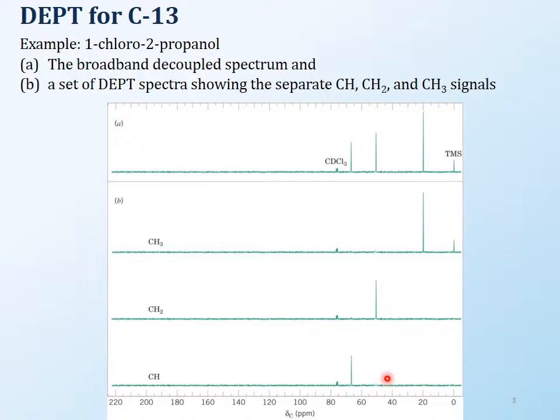That is really the neat thing about carbon 13. If you have a large molecule with 20 carbons and you're seeing 20 peaks there, then you really have no idea what's going on because there's no coupling and you can't tell which carbon is what. But if you do the DEPT on it, all those 20 carbons will be completely separated out into the primary, secondary, and so on. It makes interpreting the carbon 13 a lot easier.